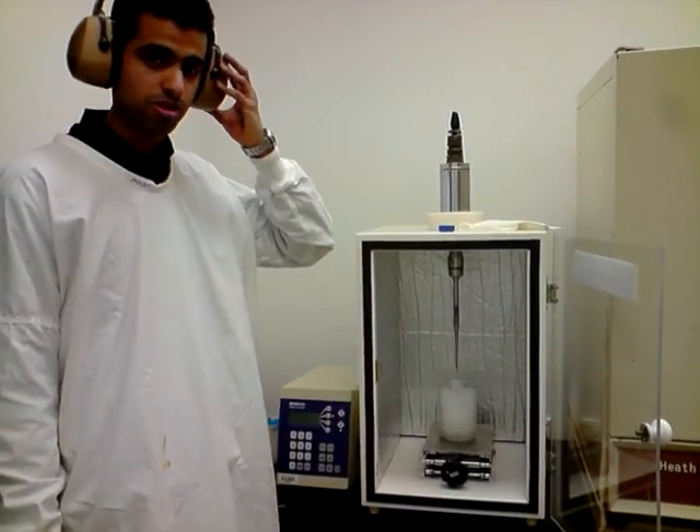And when we are using this, we should use the ear muffs because ultra high frequency sound can really damage your ears.